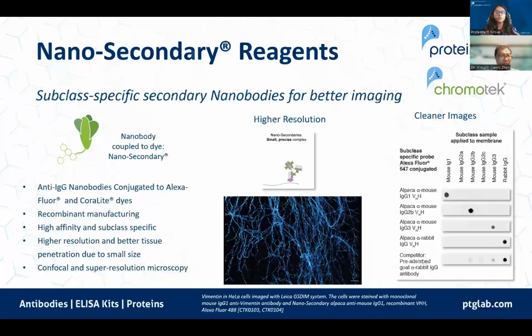Also, since nanobodies are so small, because they're about 10 times smaller than traditional antibodies, they have the ability to penetrate tissue better and bind very closely to your protein of interest. So this is going to be great for generating high-res images using confocal or super resolution microscopy, which you can see here in this image in the middle, where the vimentin was imaged in HeLa cells.